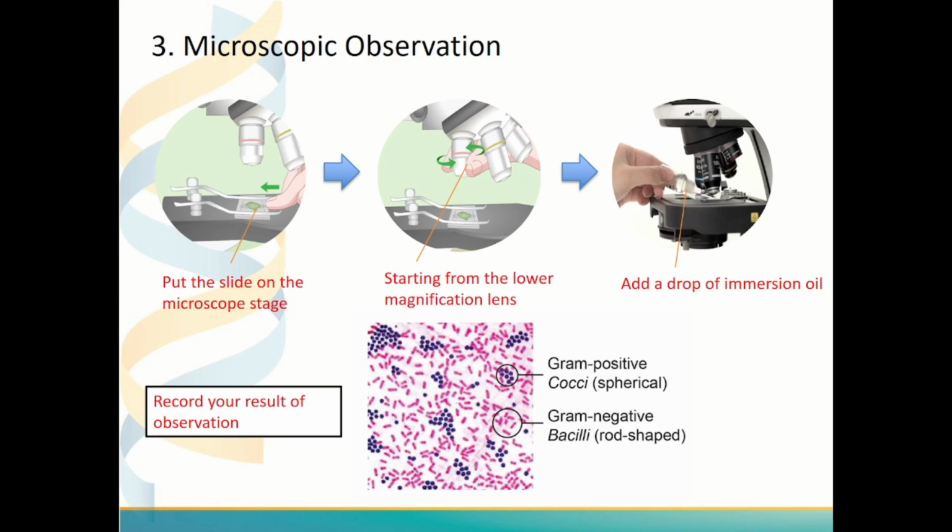Once the oil is added, you shouldn't return to the 40 magnification. Furthermore, you don't need to lower the stage when adding the oil as it will change the focus. And finally, we can observe the bacterial shape and color as you can see from the picture.